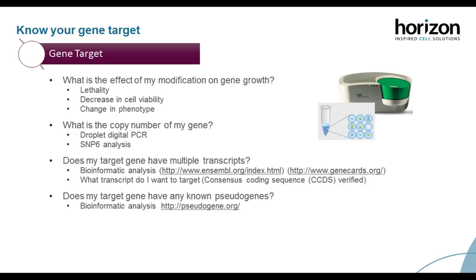I talked about the guide, but now we're just going to understand what makes a good guide and what the important considerations are that you should take when designing your guide.